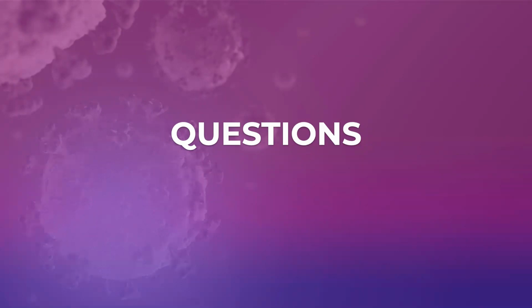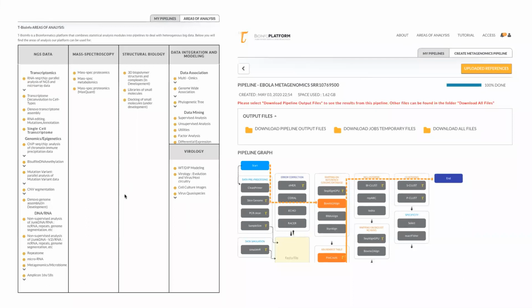How did they do it? They did it in a different section, right, that you will see described a lot more in the SF9 project, under metagenomics. Here we only were mapping onto a single genome, right? That single genome contains specific sequences, and if we don't find something, we don't know what else is in there.